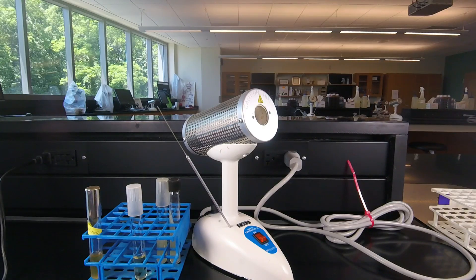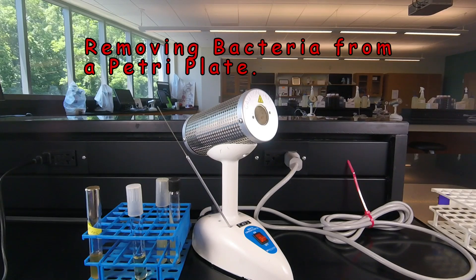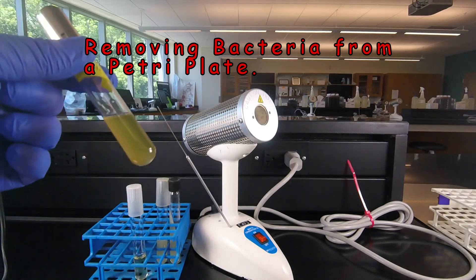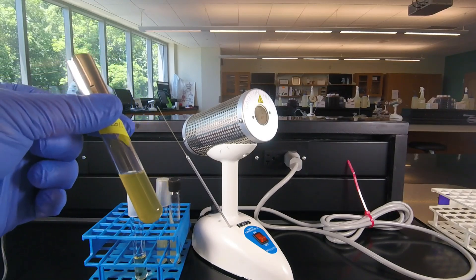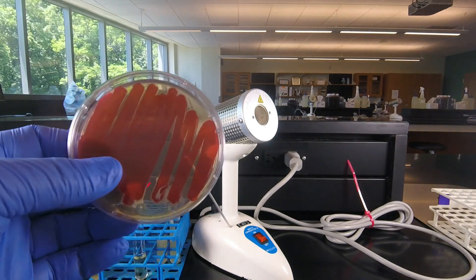While we're on the topic of petri plates, I'd also like to demonstrate how to take bacteria off of a petri plate. In the previous lessons, we showed you how to take bacteria out of a culture tube and use that to inoculate broth tubes, slant tubes, stab tubes, and petri plates. But often in lab, we're going to be taking bacteria off of a petri plate.